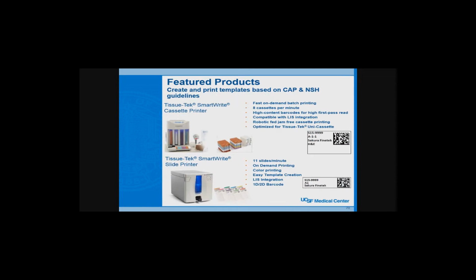If they're using a linear barcode, the one you see with the up and down lines, that could be true. If you're using a 2D code, then it can hold plenty of information. And that's why you'll see most of these systems are going to 2D. They call it 2D data matrix or other. Yeah, here's on the screen there. You can see the 2D code. And so that might be, I'm not sure what etcher it is.